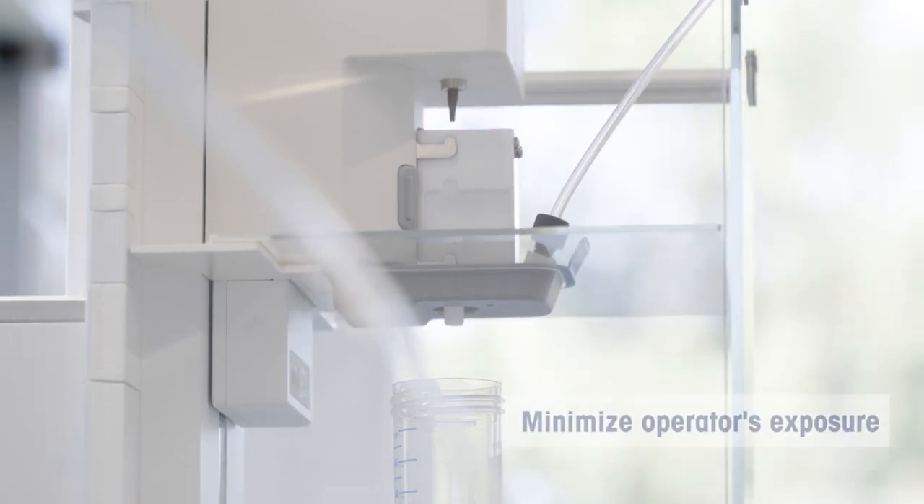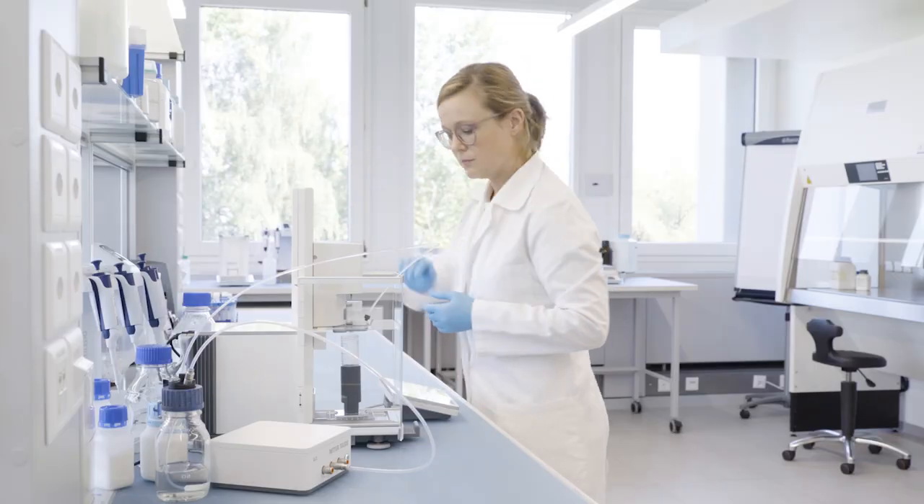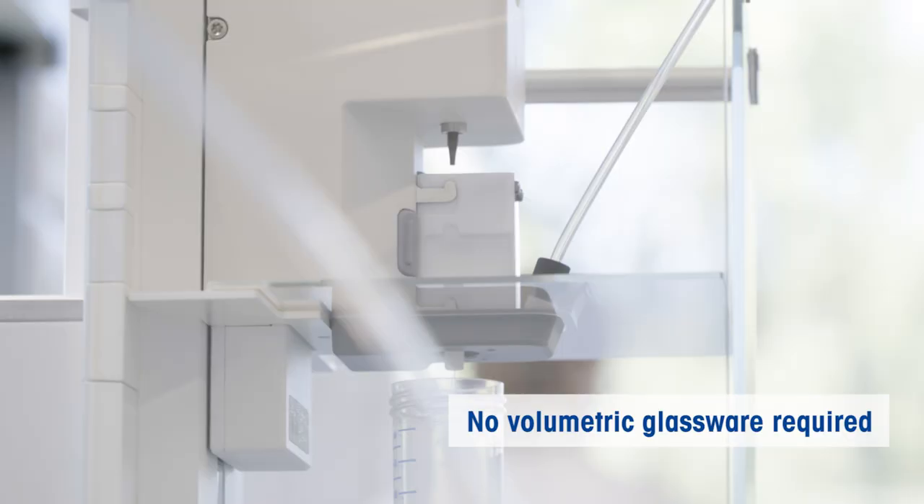You also minimize the operator's exposure to hazardous substances. And the best thing about it — no volumetric flasks or pipettes are required.